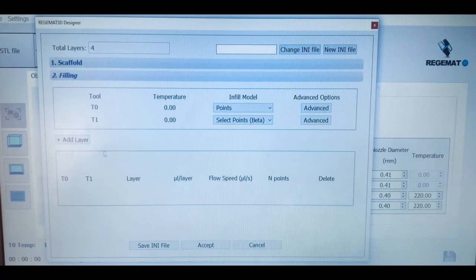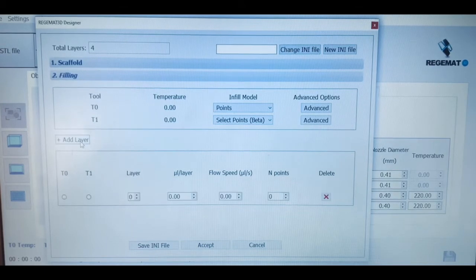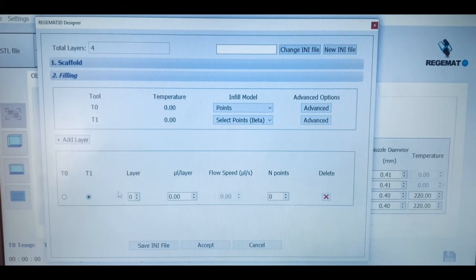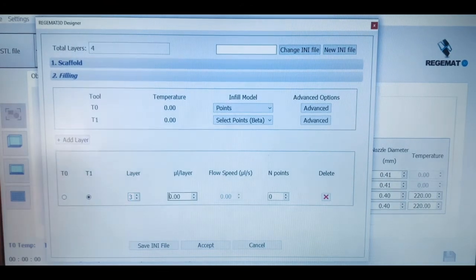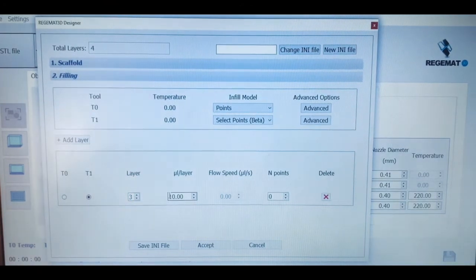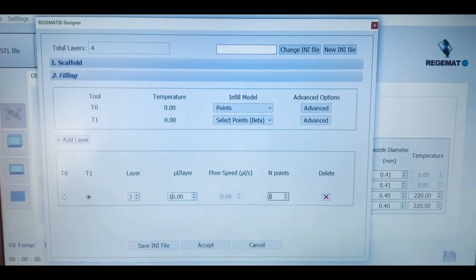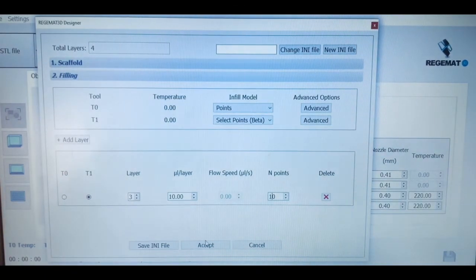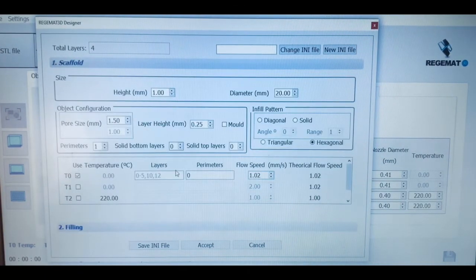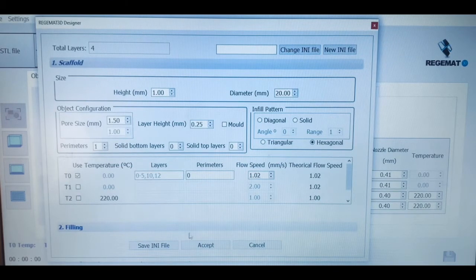In the case that we want to create more complex biological constructs of multiple cell types, or co-cultures with different biomaterials, we can fill the pores of our structures with different types of infill models, select the layers, volume, and the number of pores to be filled with that bioink.